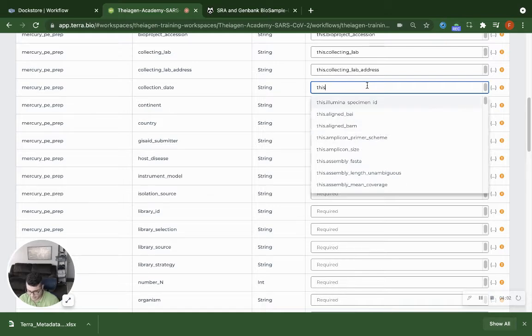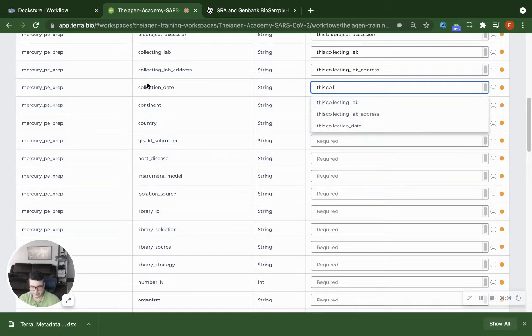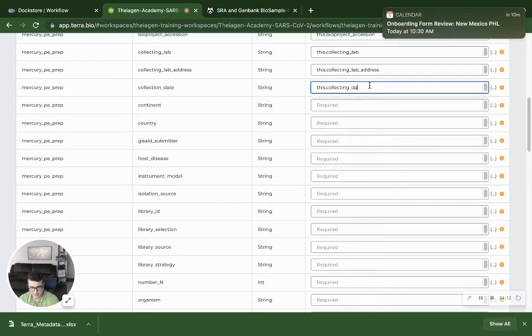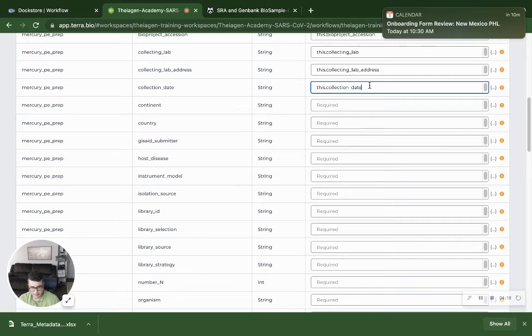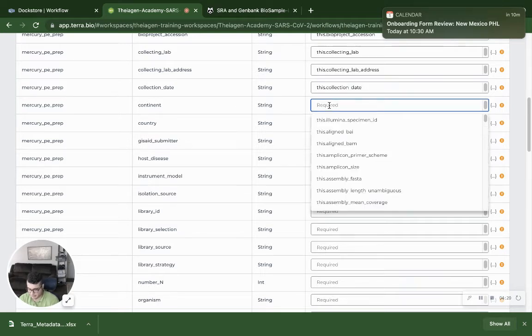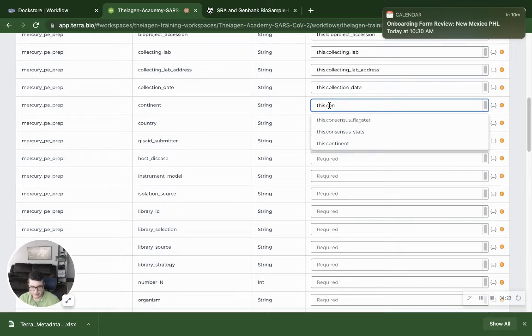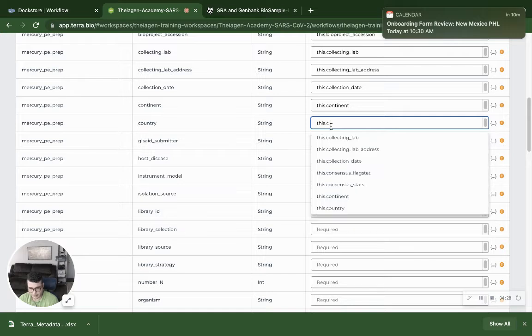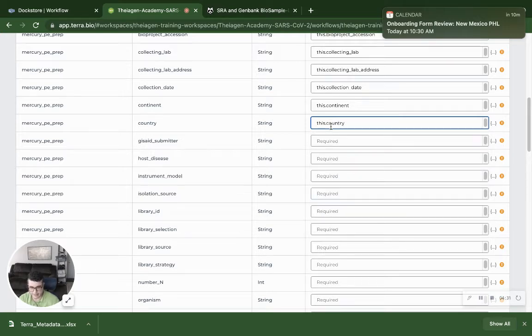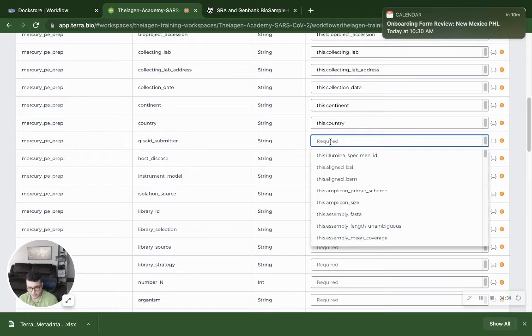So to speak on using the Clear Labs FASTAs a little bit more. The Clear Labs FASTAs do have that error correction built in. However, the entire pipeline is proprietary, meaning as opposed to the Titan workflows, where you can go on GitHub, you can see the exact code, you can see all of the internal tools that were used, whether they be a mapping tool, an alignment tool.